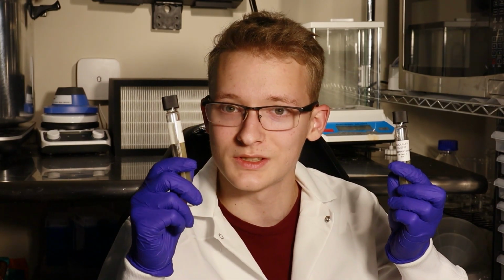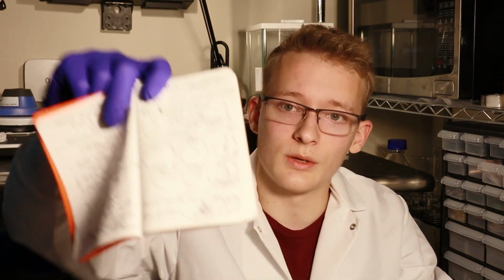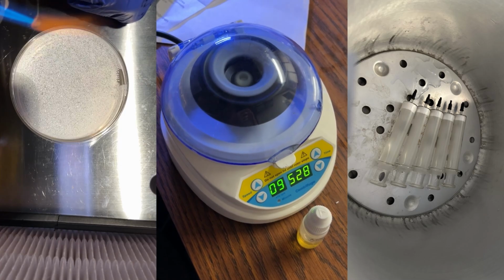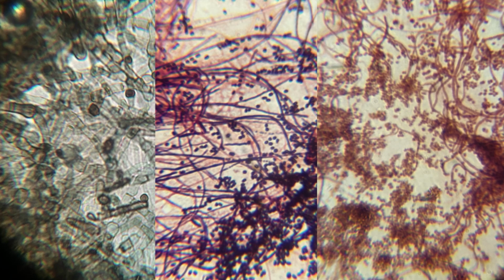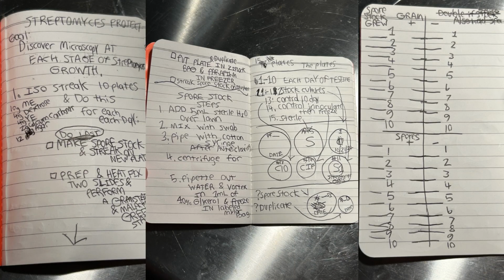But now I was thoroughly interested and wanted to see this for myself, so I pulled up Carolina Biological and bought myself 2 vials of Streptomyces griseus. In an attempt to understand what was going on with the stains in microscope photos, I put together a 10-day project called the Streptomyces Spore Project. But this project may or may not have ended in failure, and unfortunately this early part of the project was not filmed, so I reenacted it for this video.